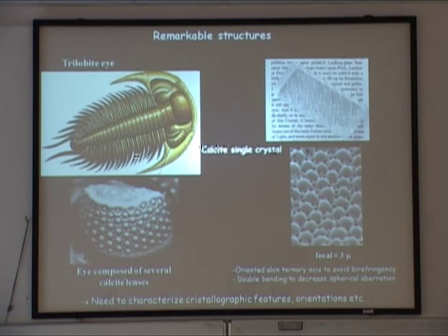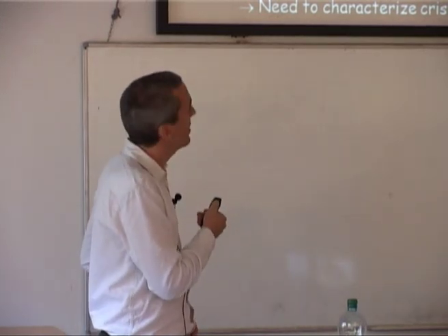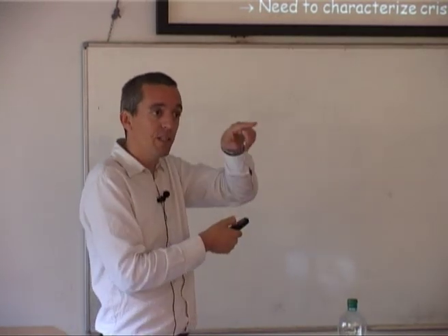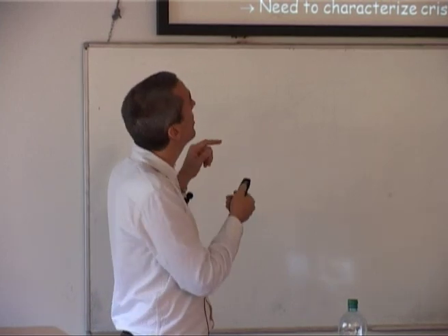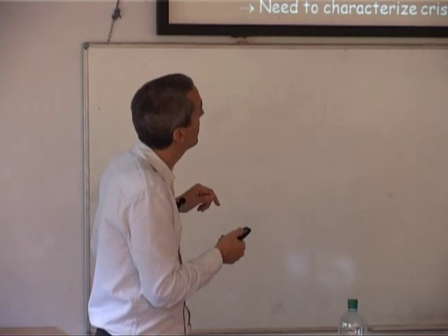And for that, you need to orient this calcite single crystal in a very specific axis. If you look this way under this axis, it's okay. So now that's what they are doing. Those calcite single crystals are oriented in a very specific way so that you don't have this effect.